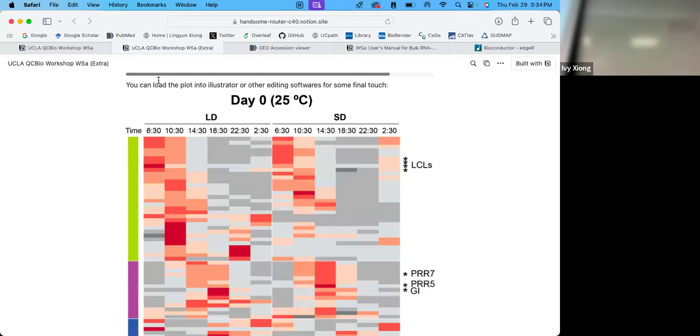I managed to make it work. Go back to the screen. Good, I didn't know where to do this. This is what she's written. Yeah. So then you really need that gene, that particular gene. You can copy paste it. We run that.